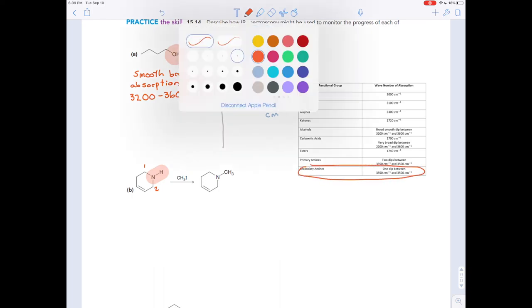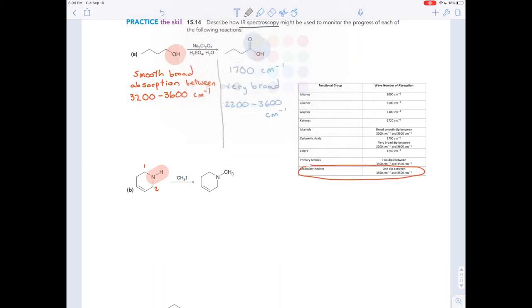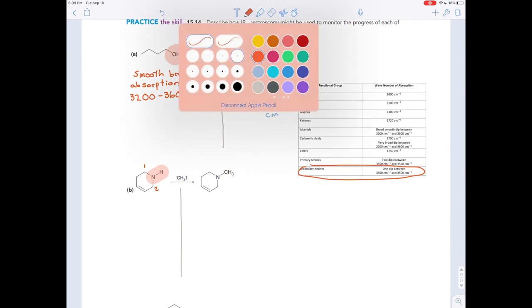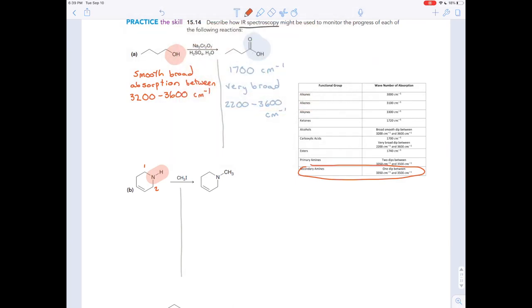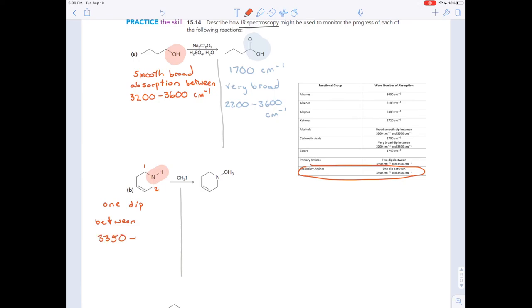So, what you'd expect on the left: you'd expect to have one dip between 3,350 and 3,500 wavenumbers.